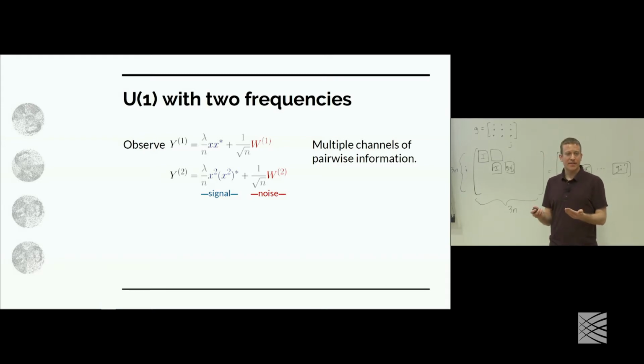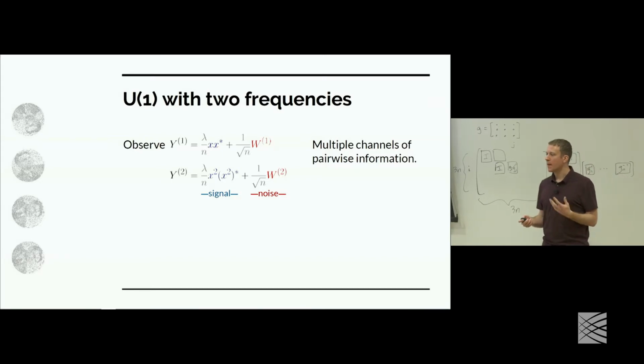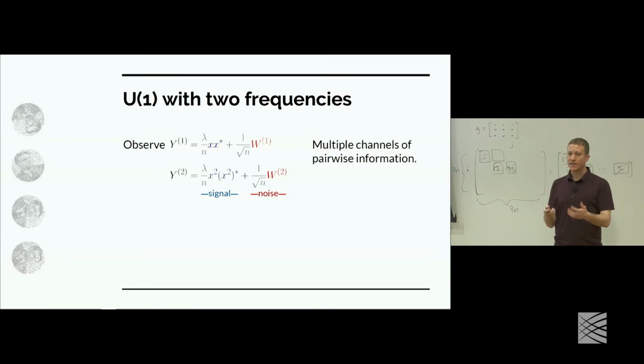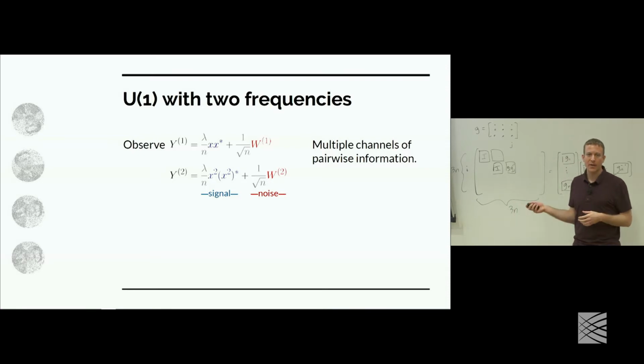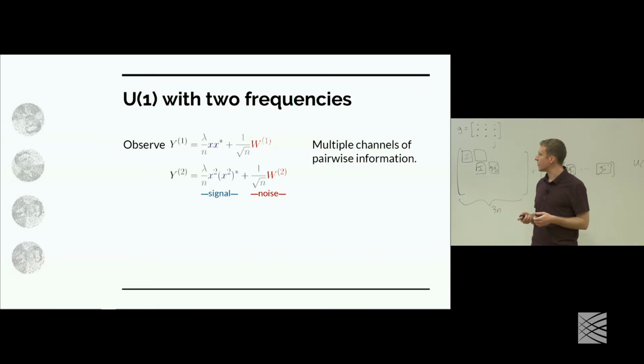The reason we're doing this is because in real problems like cryo-EM, you really have information on all sorts of different frequencies, which I'll get to. And originally, when I said PCA has this problem of linearizing the samples, this is how we're overcoming this: by allowing information to be on all frequencies rather than just the first frequency.